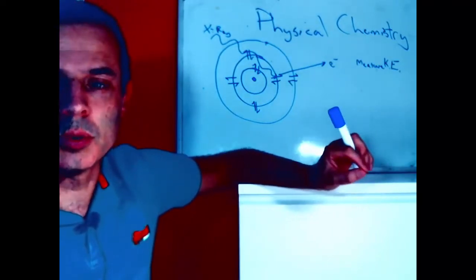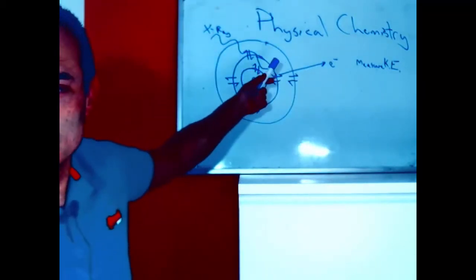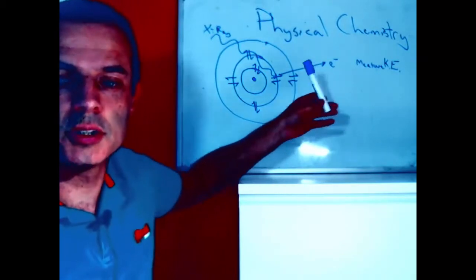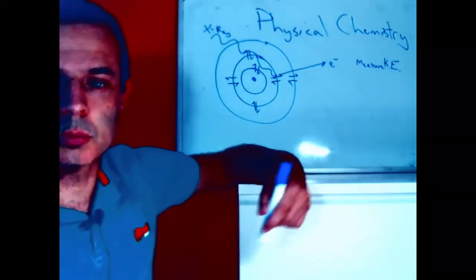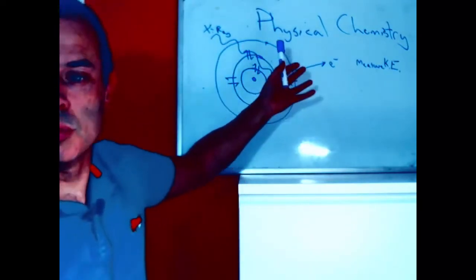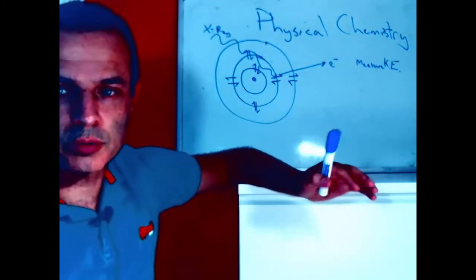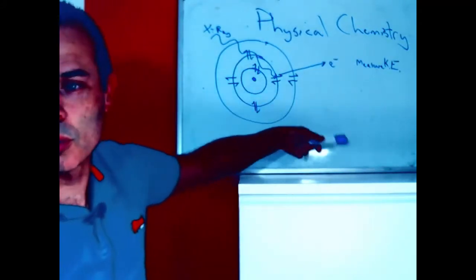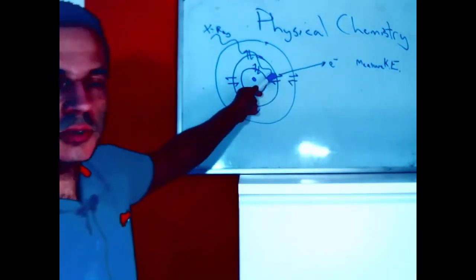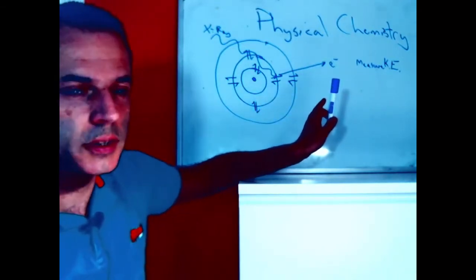Typically we would do this using a bent crystal of something which will behave like a diffraction grating. The lines of atoms in our crystal will split the X-ray into different colors, and in the reflected spectrum, the only X-rays that come off will be the ones that we want, a relatively narrow band.